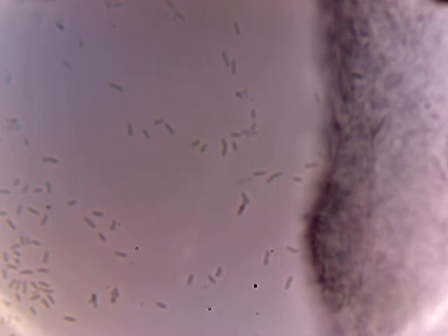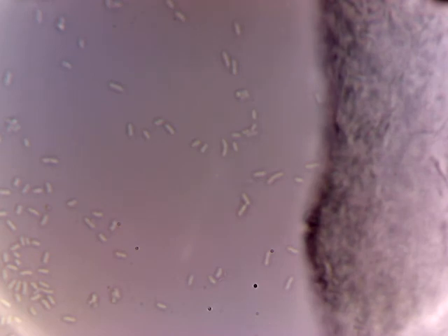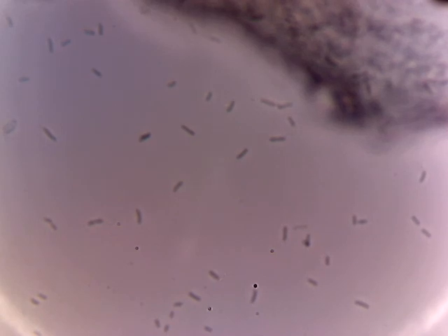There's one that's stuck — there were two stuck there for a second. They get hung up sometimes, and that's when you have your prime moment to observe their shape. And there he is, standing out in white a little bit — altered the focus there. You can see it's a clearly straight-looking, rod-shaped organism. Maybe a little kink in there, but not much. They're all along the edge. Quite a lot of them.